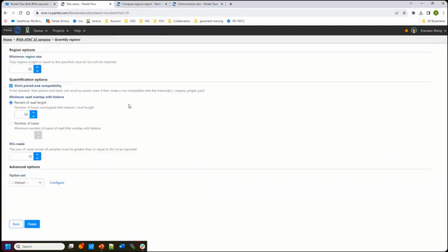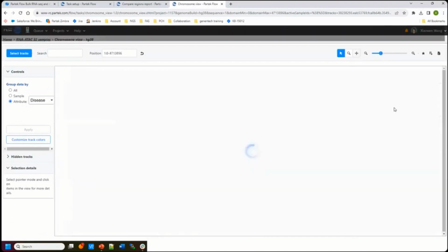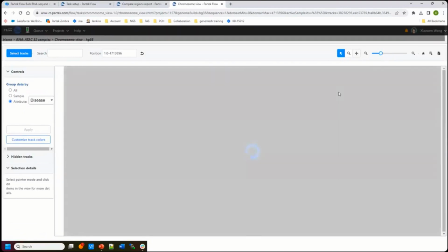And when you quantify the regions, first of all, we're going to join all the breakpoints. So like here, let me just zoom in a little more. If you have one sample where the region is from base pair 1 to 10, and the other one is from 8 to 15, we're going to make the regions 1 to 8, 8 to 10, 10 to 15.